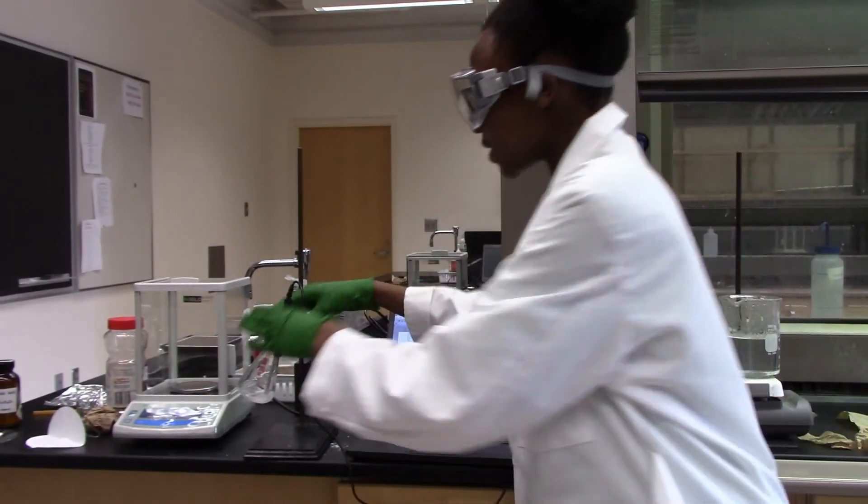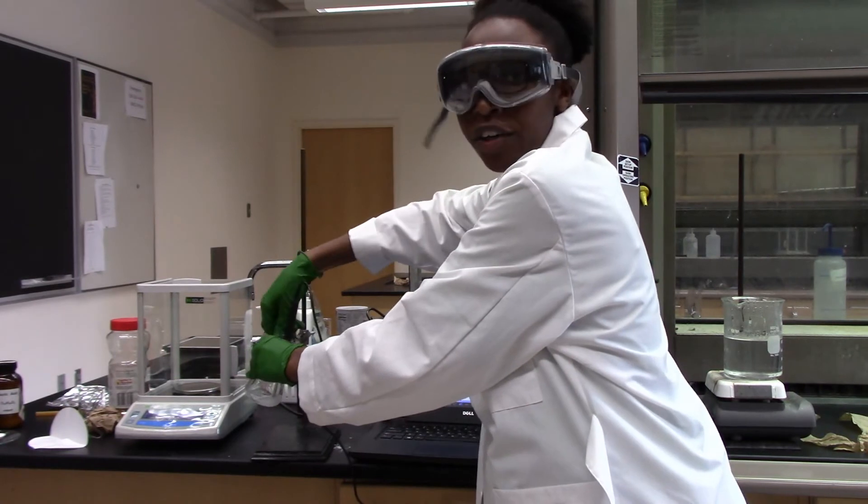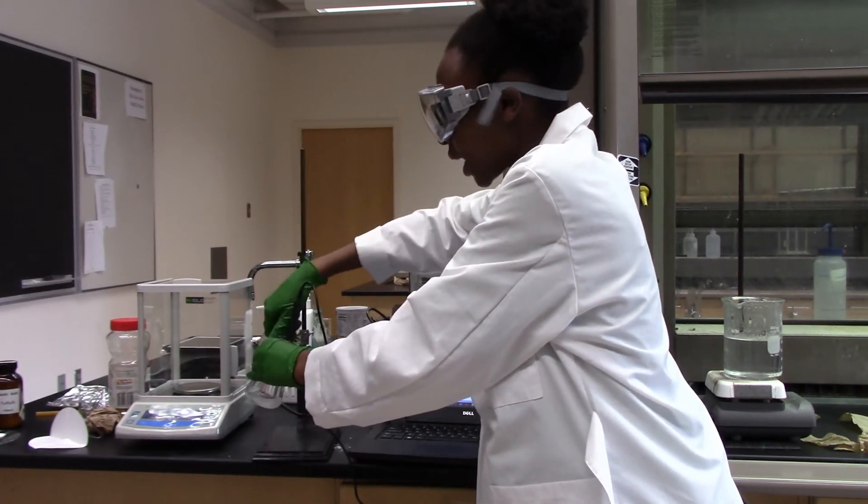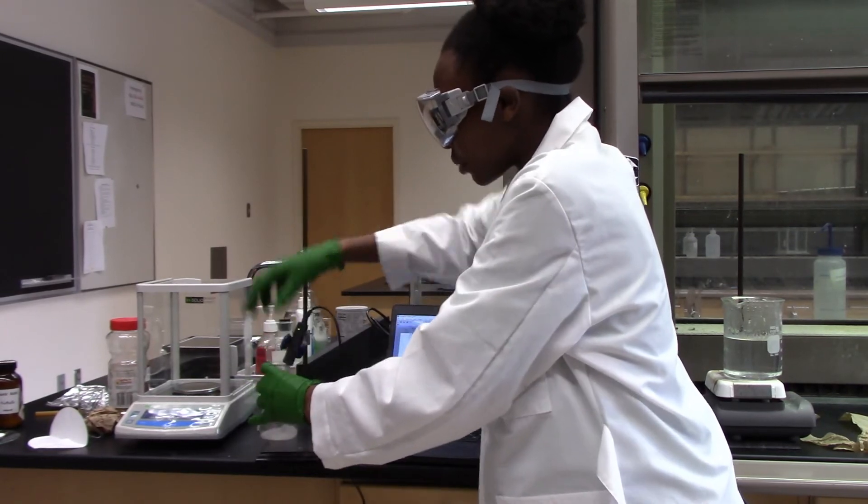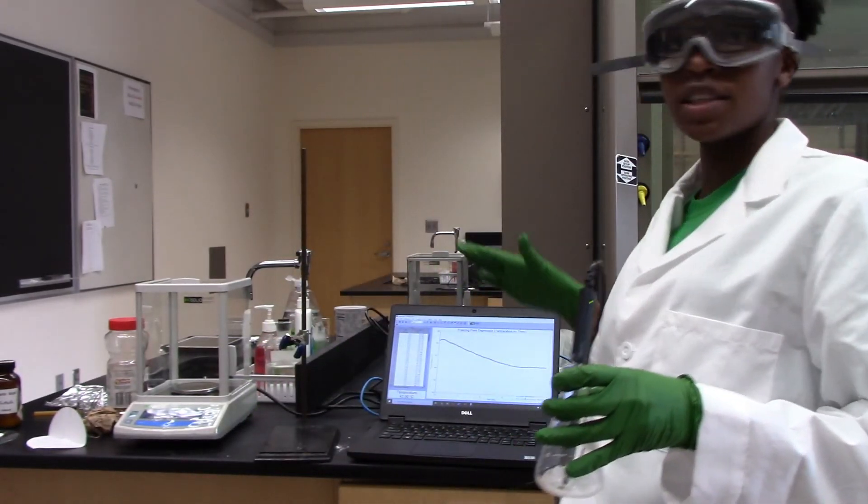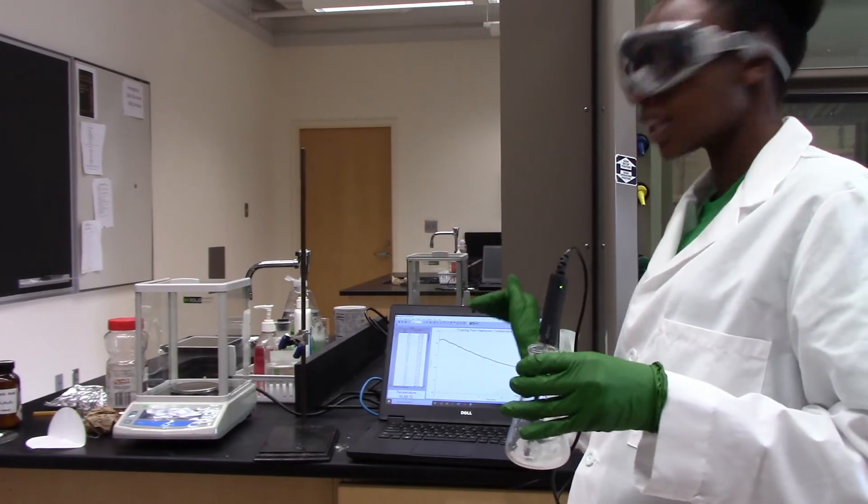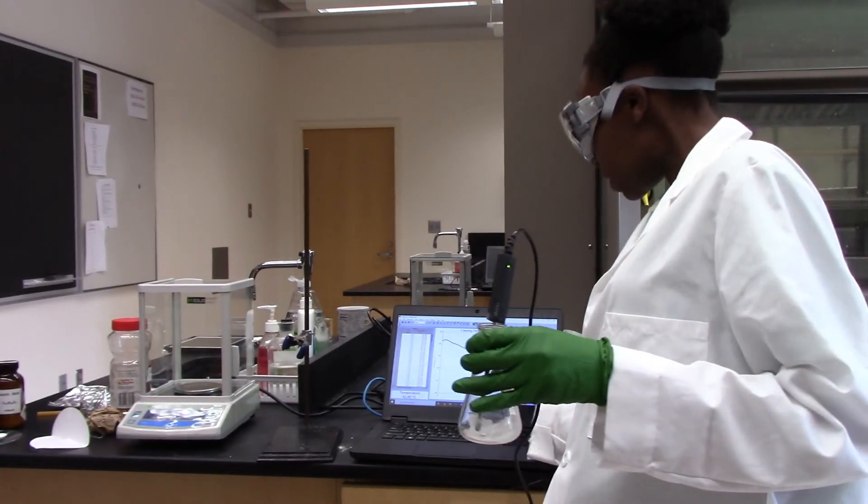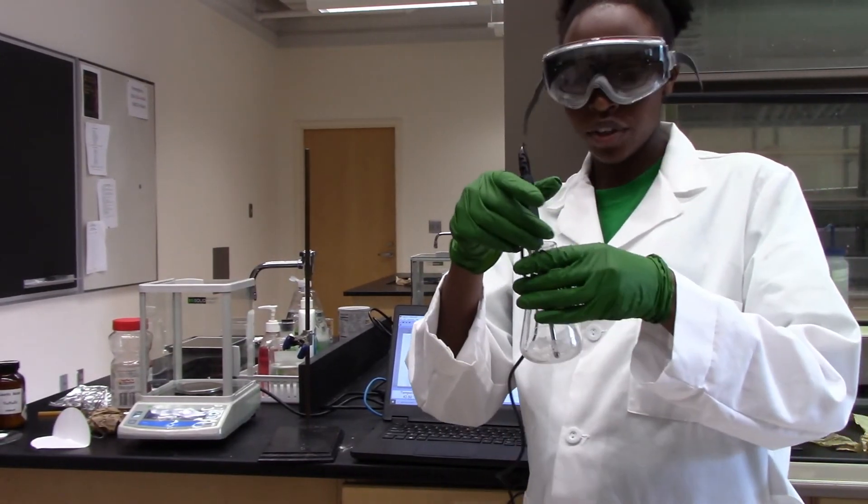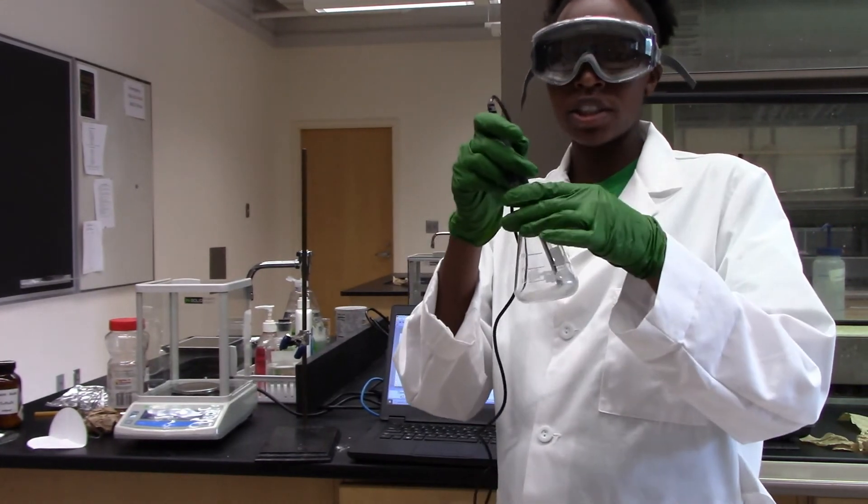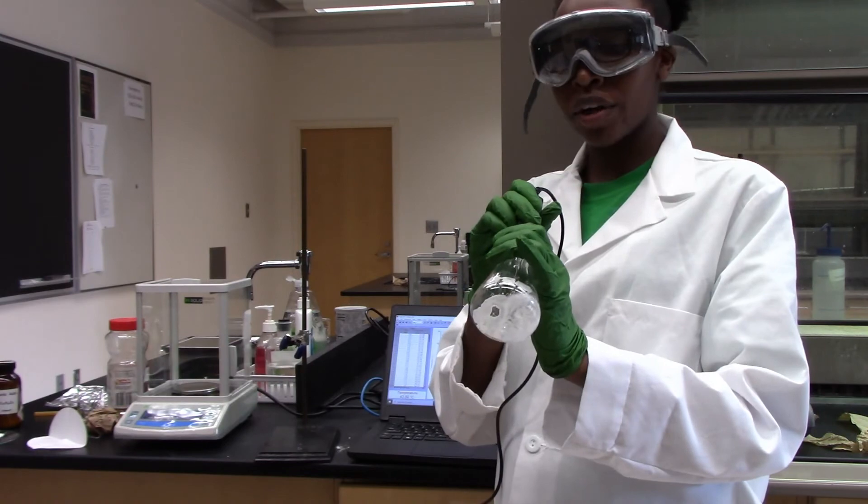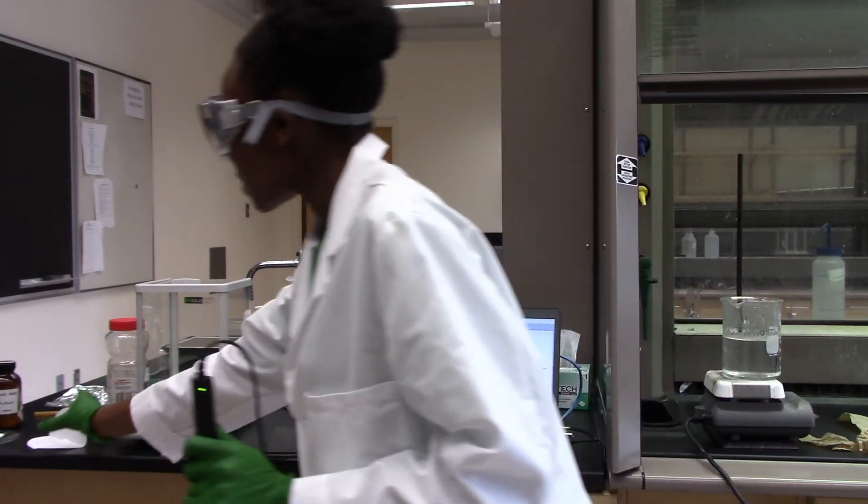Now we can see that our lauric acid has become a solid, so we have reached a constant temperature. Here, as you can see, the graph is slanted fast and then it levels off, so at this constant temperature is when you get your freezing point temperature for lauric acid, and it's a solid right now. So I am going to add my unknown to this.